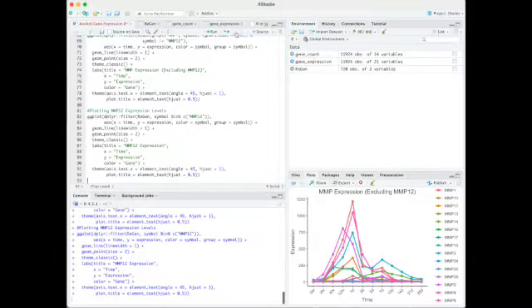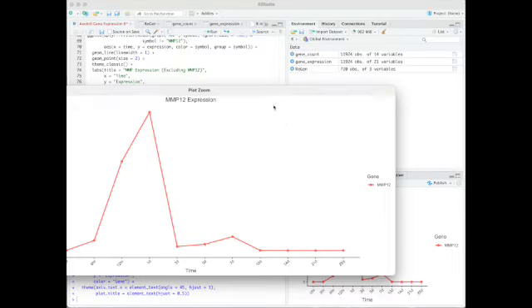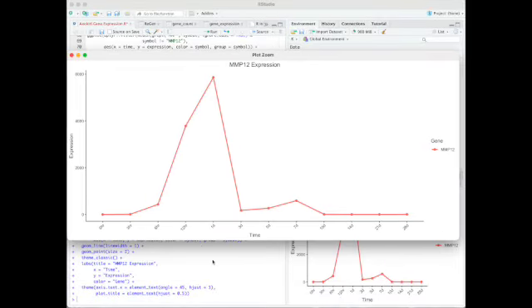Having MMP12 plotted, we can better observe its extreme increase and decrease in expression, jumping from 0 to 4,000 and then 6,000 over a span of 9 hours. It is the highest expressed gene throughout all the extracted regenerative genes in our data, indicating its significance in wound healing and blastema formation directly after amputation.